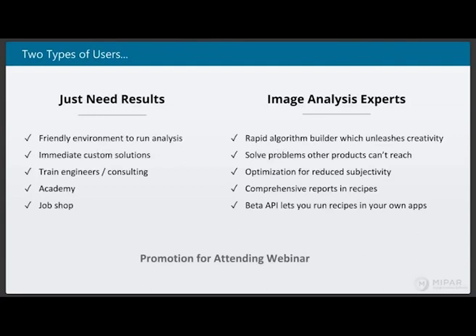This might be, or it might be some other, simpler solution, depending if some of the minerals have a circular type of morphology, or if they have more of a rough shape, we can maybe separate them based on that as well. But I completely understand that it is fairly challenging once you get to more than your 3 colors.